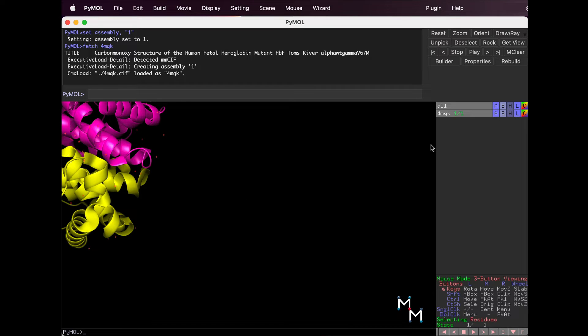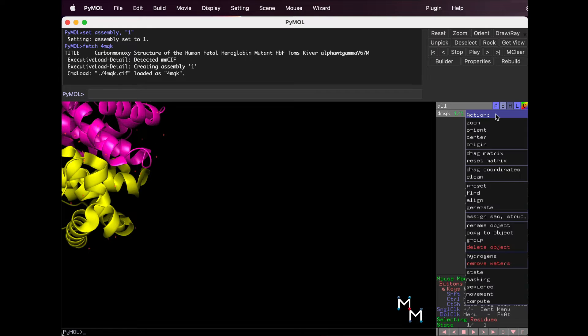To re-center, click the Action button, the little A here in the Names panel, and select Center.